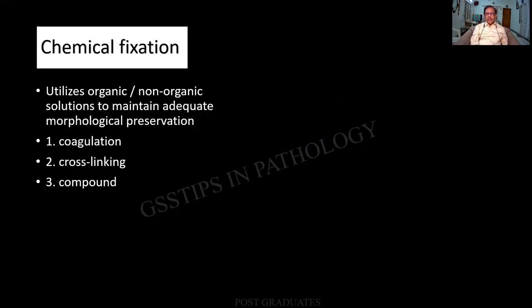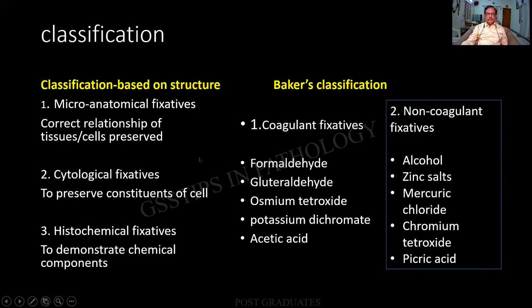There is something called chemical fixation. It utilizes organic and inorganic solutions to maintain adequate morphological preservation. It can be by means of coagulation, cross-linking, or compound action. And this is a classification of fixatives which I would like you people to kindly memorize.